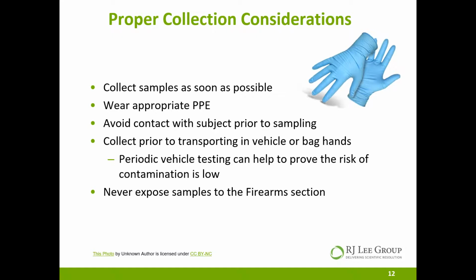If you have to transport them in your vehicle, we always recommend to bag the hands of the subject before putting them in the vehicle and transporting them. It is possible to get secondary transfer of particles from the back of a police car, but the potential is low, especially if the hands are bagged.